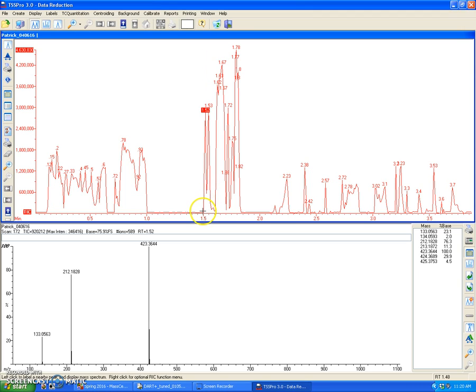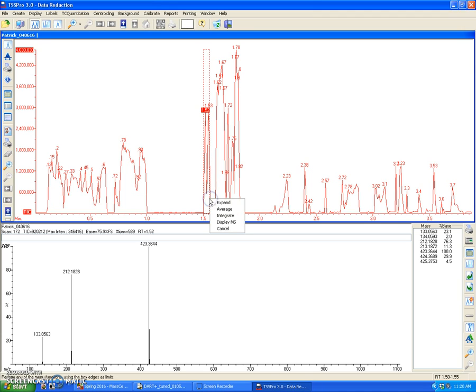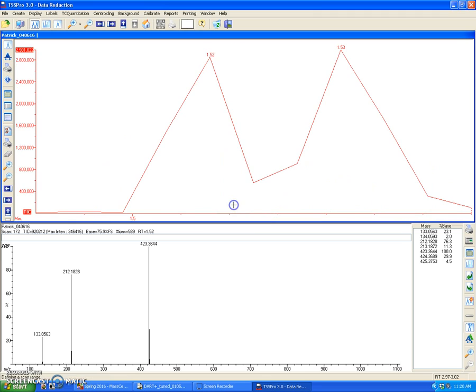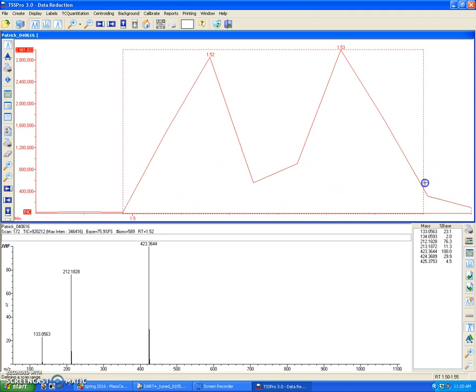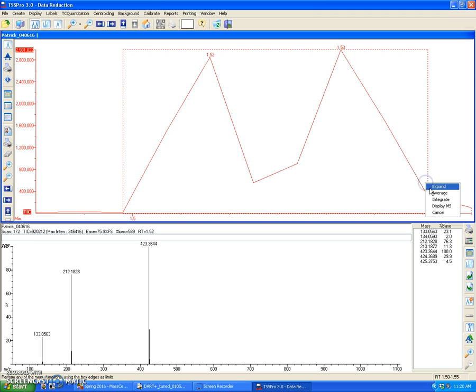Another thing that I could do is left-click, drag, and open this window. Once you release this left-click, you can expand, so that means zoom in onto that region. You can drag, left-click, drag, and then average. So this averages the mass spectrum of this region.